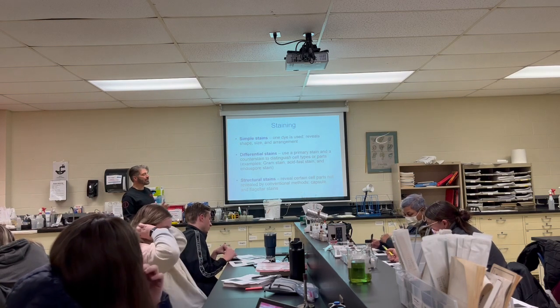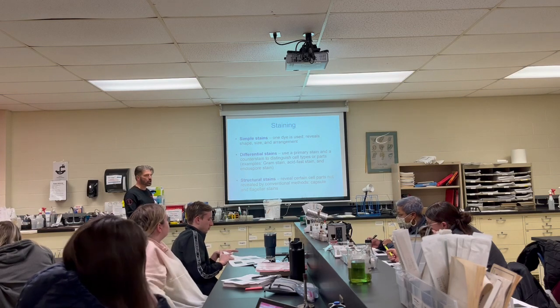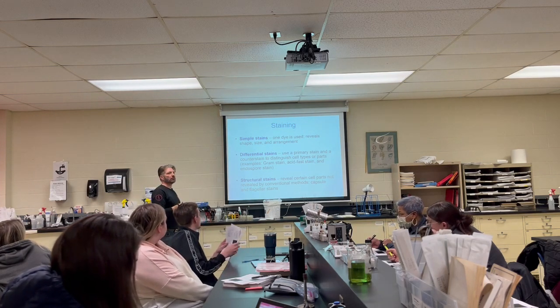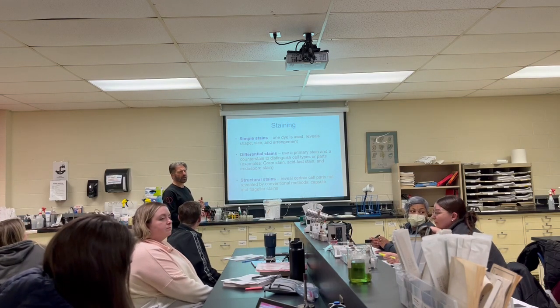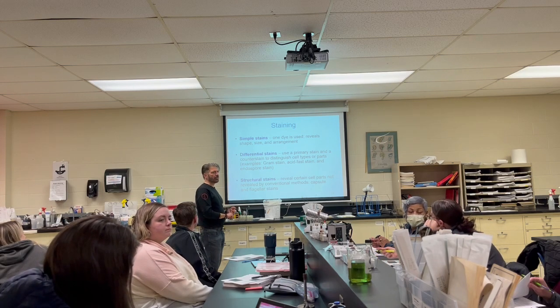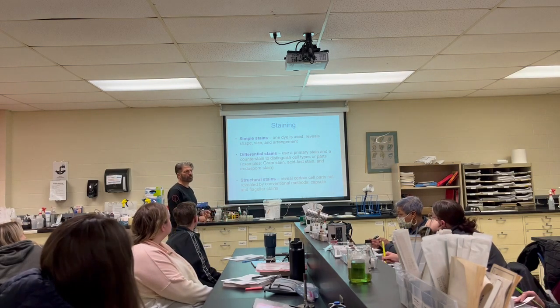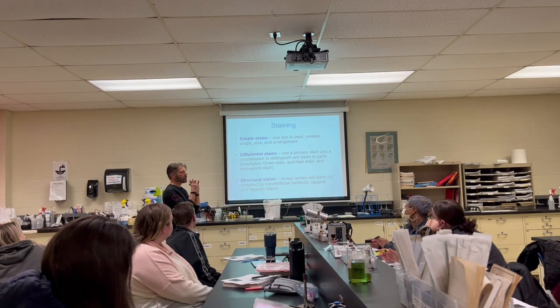Today we're going to be doing a simple stain in lab, which just means you can take your pick of any dye over there. Green, pink, purple, whatever. I think we have methylene blue, safranin, crystal violet, whatever color you want. A basic stain will just let us know the shape.